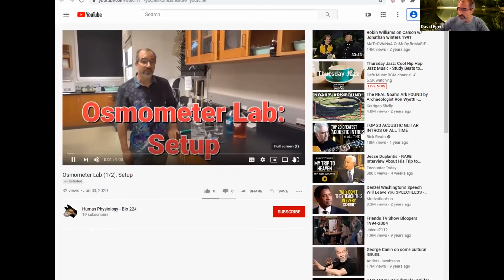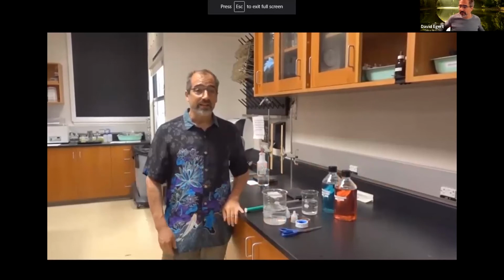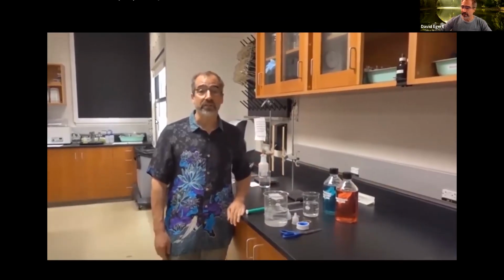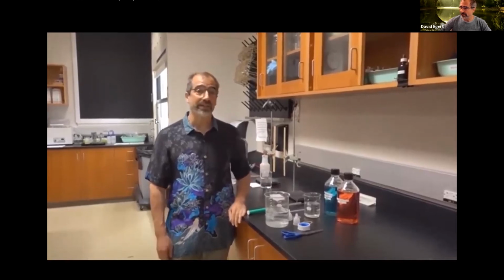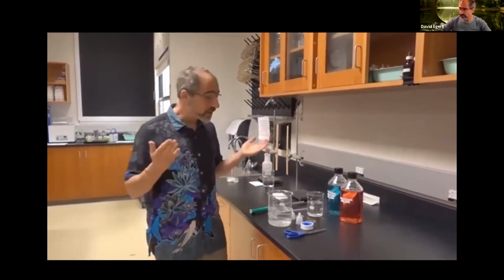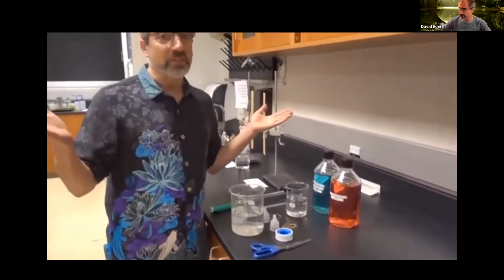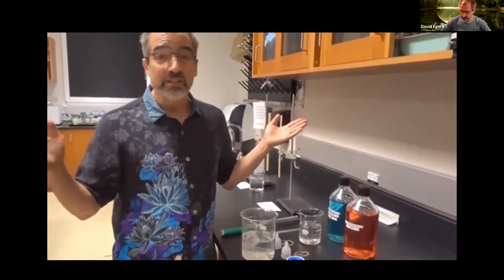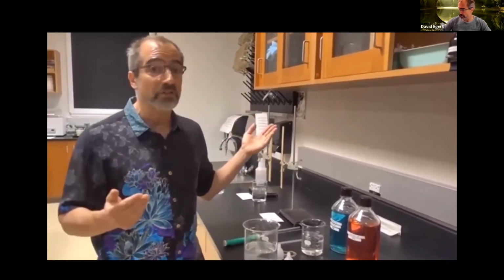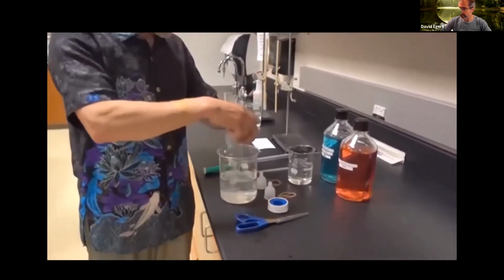All right, so this is the Osmometer Lab. For this lab, we're going to be measuring the rate of osmosis under different conditions. To do that, we're going to need an instrument called an osmometer. The osmometer is actually super simple. Osmosis is just diffusion of water across a semi-permeable membrane. So if we're going to have osmosis going on, we need a semi-permeable membrane. That's this stuff right here.